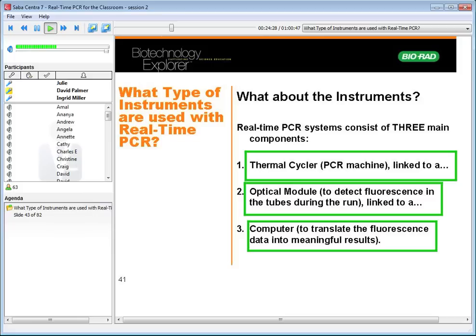The final product of real-time PCR data is essentially a table of numbers. The graphs are nice to look at, but it's actually the numbers that let us do the quantitation or the calculations. So for example, for every well that you have, in this case I highlighted well A3, it's going to have the fluorophore SYBR in it. It may be a standard, and it crossed the threshold at a CT of 8.9. Another well could be this one, B6, contains SYBR as well. It was a standard and it crossed the threshold at 18.69.